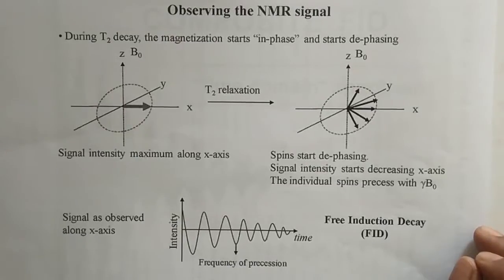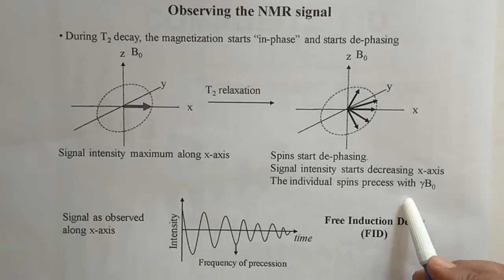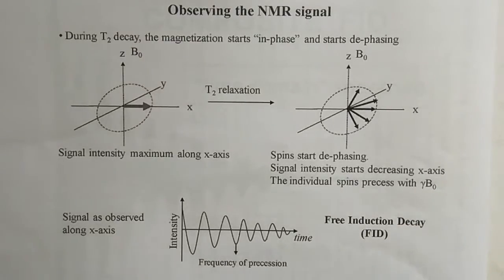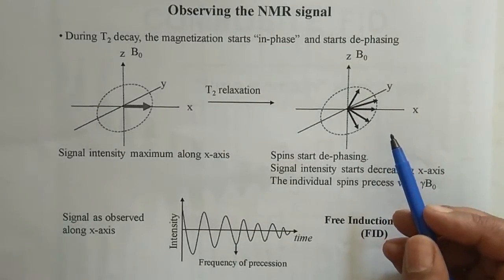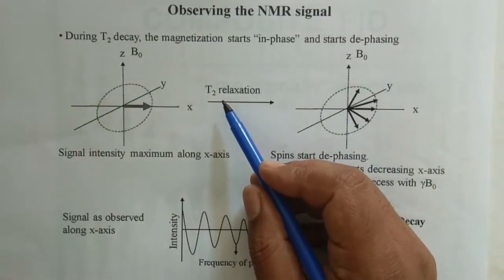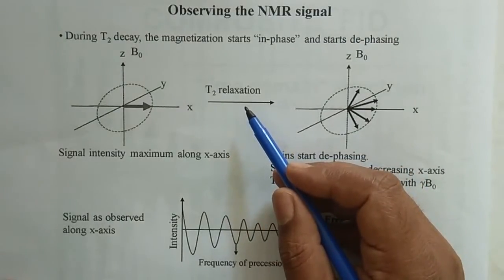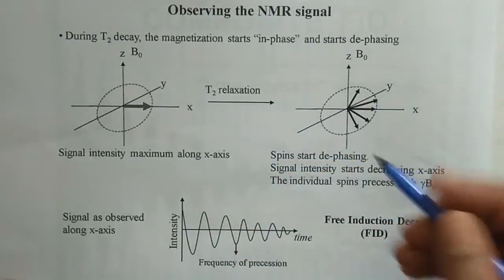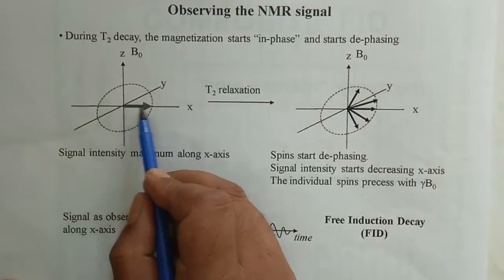So guys, if you can recall, in my last lecture of the NMR spectroscopy lecture series, I stopped at this particular slide which you can see here. In this slide I already explained how we can get the NMR signal. So this was your T2 relaxation, right? And as you know, in T2 relaxation your random phase approximation would be achieved. And here you can see this is your net magnetization, oriented bunched together.